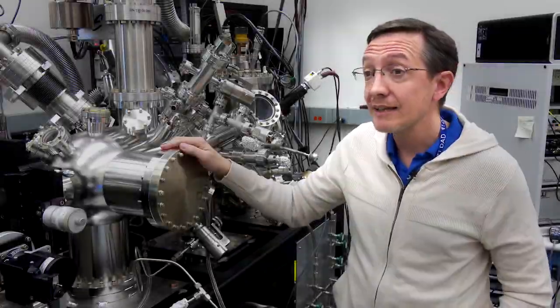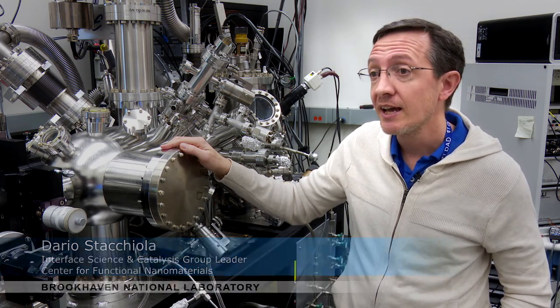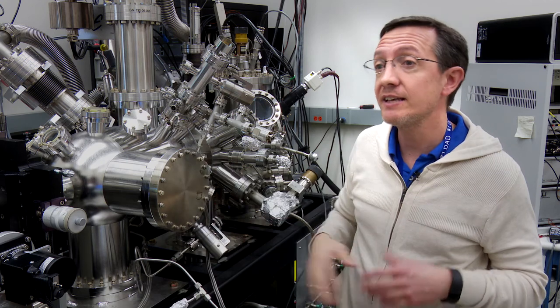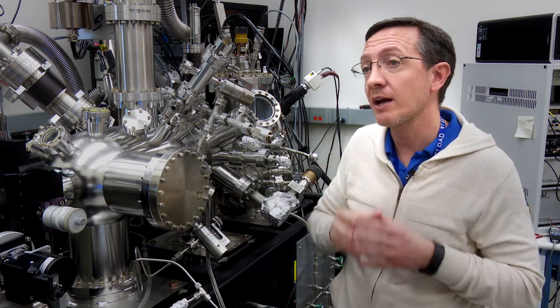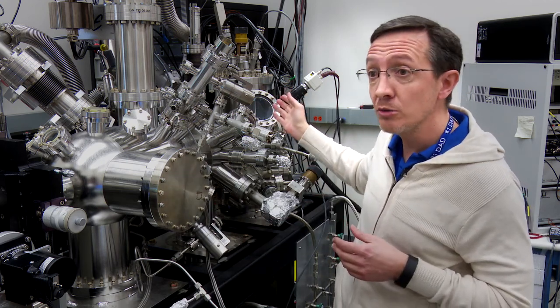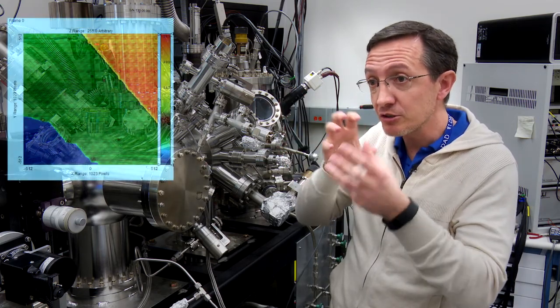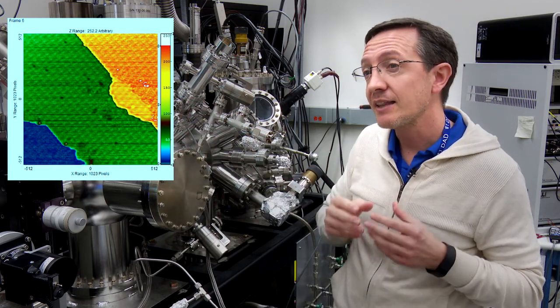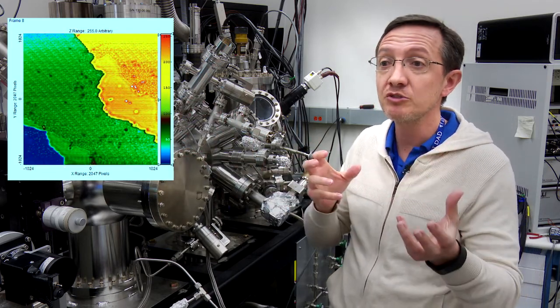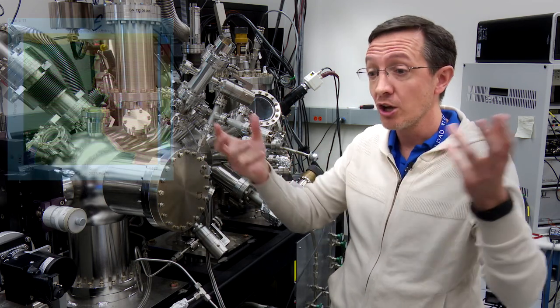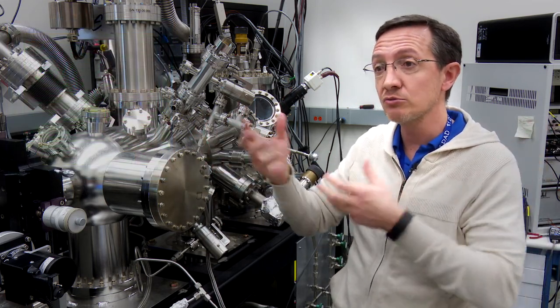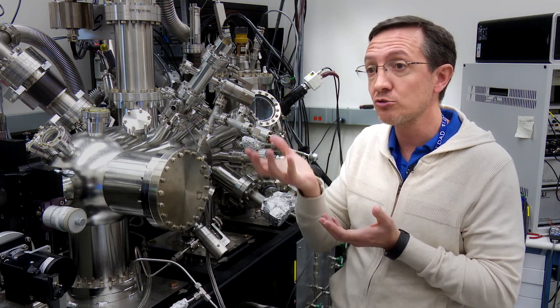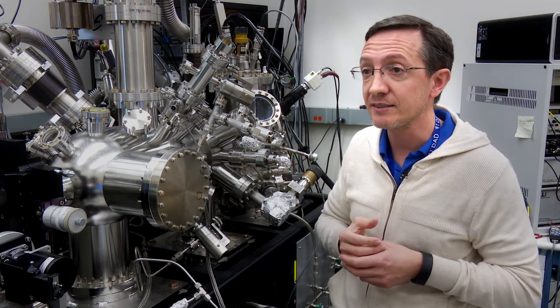We look at chemical processes that happen at surfaces and interfaces of materials that are used in energy processes, and we try to capture these as they are happening at the atomic and molecular level, both using microscopes that give us pictures and movies of all these processes, but also very advanced spectroscopic techniques that actually tell us the chemical composition and the changes that occur on the chemicals that we are trying to transform and also on the materials that are used to accelerate those processes, which are called the catalysts.